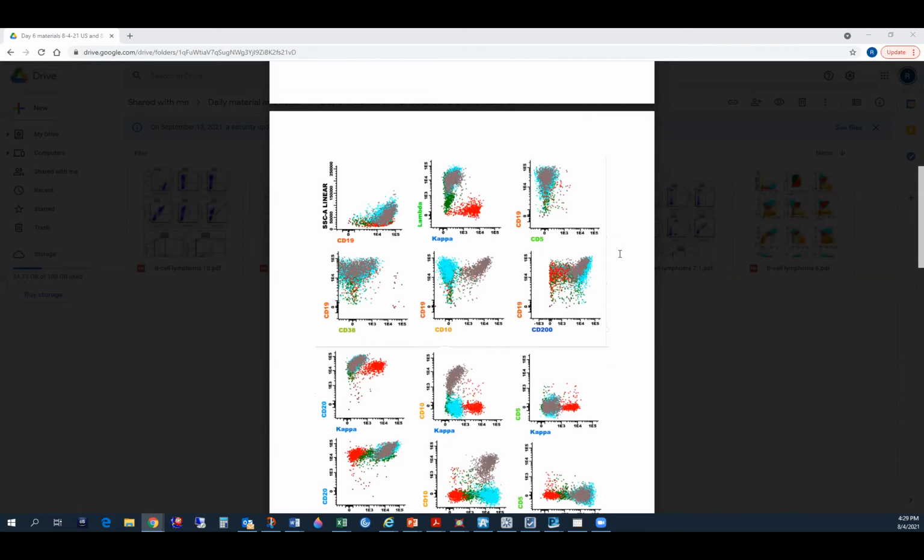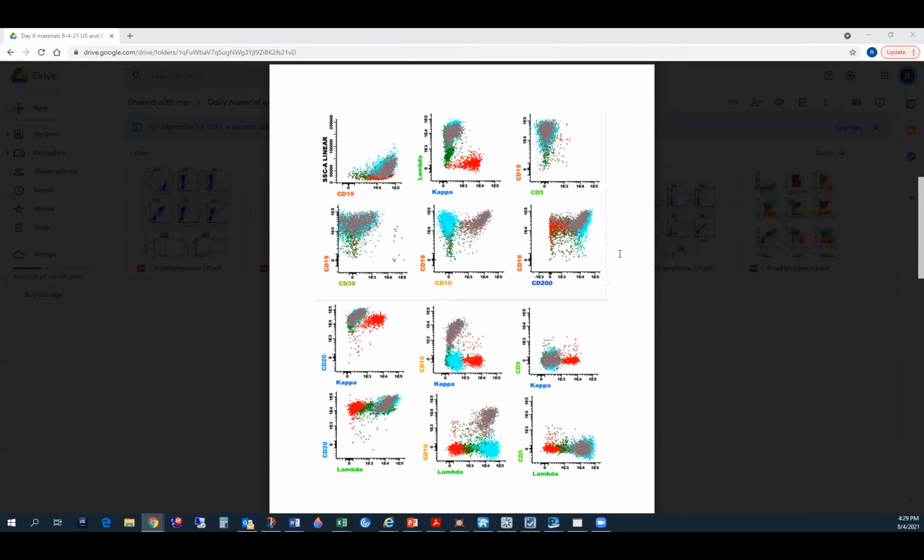How would you line it up in the final diagnosis? What would be your line diagnosis? So we would say one population, CD103 positive, kappa restricted monoclonal B cell population consistent with hairy cell leukemia, and then on the second line, a separate monoclonal CD10 positive, lambda restricted population is identified. We would write it like that. Anytime we see two clones, we write that a separate whatever restricted, this much percent B cell population is identified. We do that.